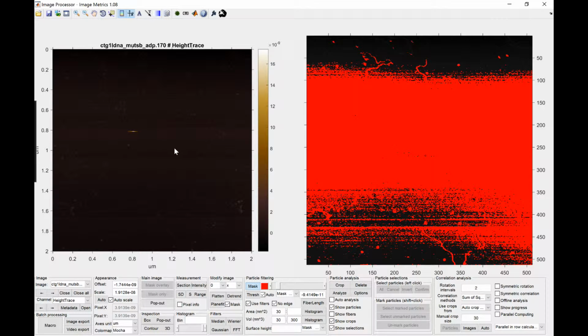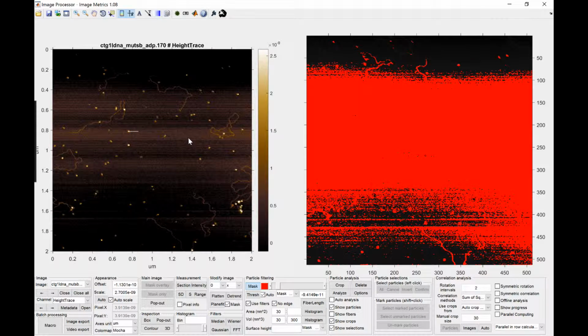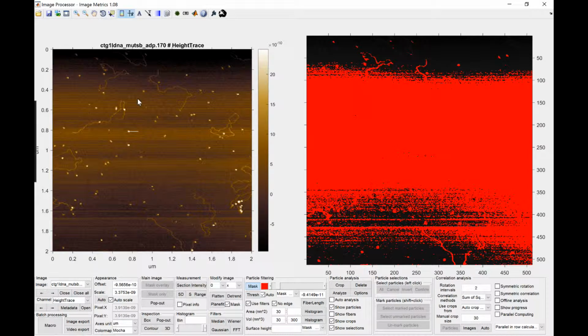Right now, as you see, the image is very dim because there is a higher spot in the center. So what you can do is use a scaling box. Just right click the image and click draw scaling box. Now you can draw a scaling box. What this does is average the scale within that scaling box. So it basically ignores the area outside, and only uses the data inside that scaling box. If this is good, you can try to focus on a specific area. For example, I want to see this DNA better. Just draw a scaling box, and now it lightens that up.